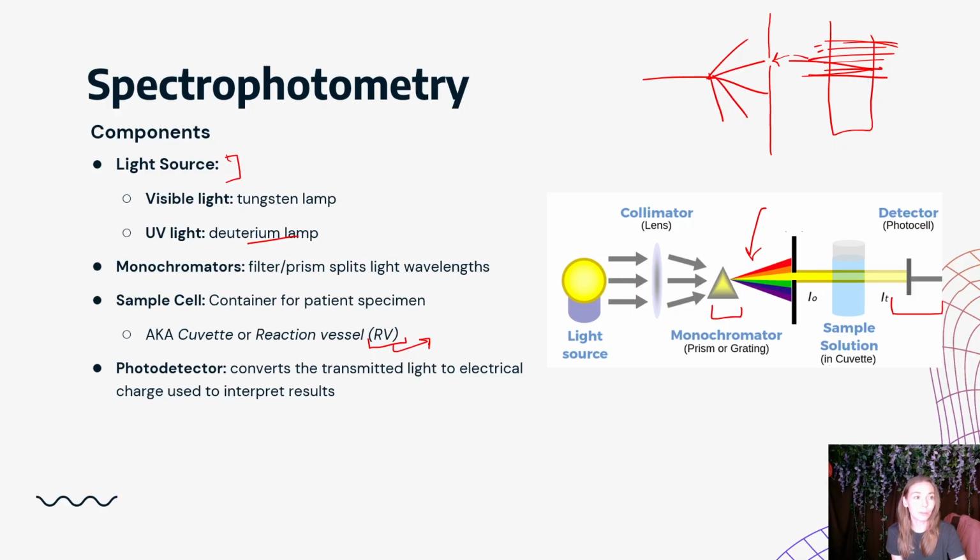Cool, thank you. Let me tell the computer. It takes the amount of light and converts it into an electrical charge, pushing the electrical charge to the computer. That way the computer can be like, yes, I understand what's going on here. I see how much has been passed to me. I know how to do this.